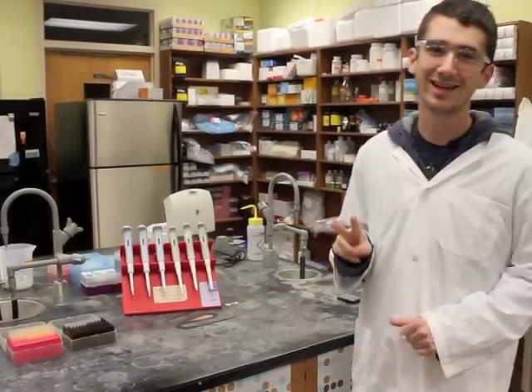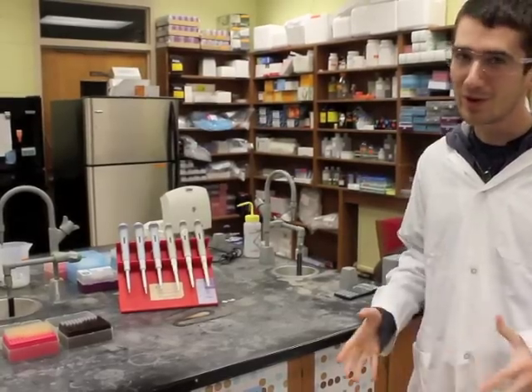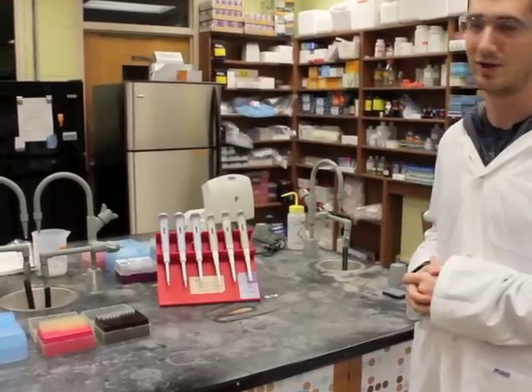Hey guys, and welcome to your second and final biochemistry lab. This week we'll be doing PCR, which stands for polymerase chain reactions, and we'll be using these micropipetters during the lab.